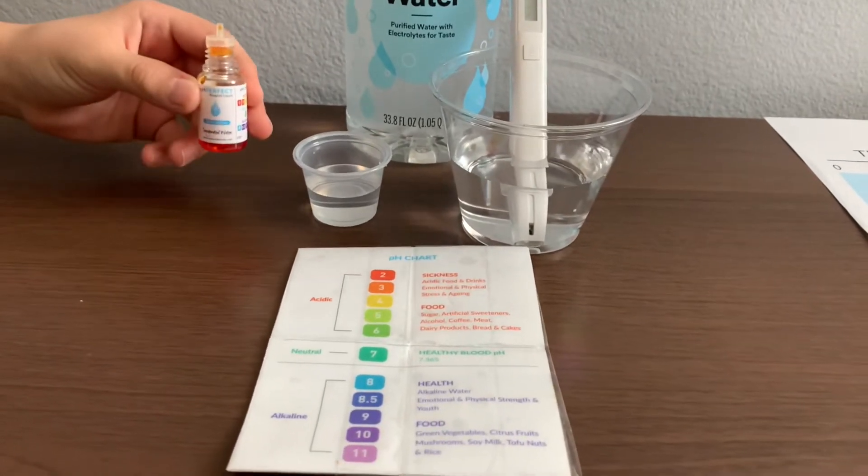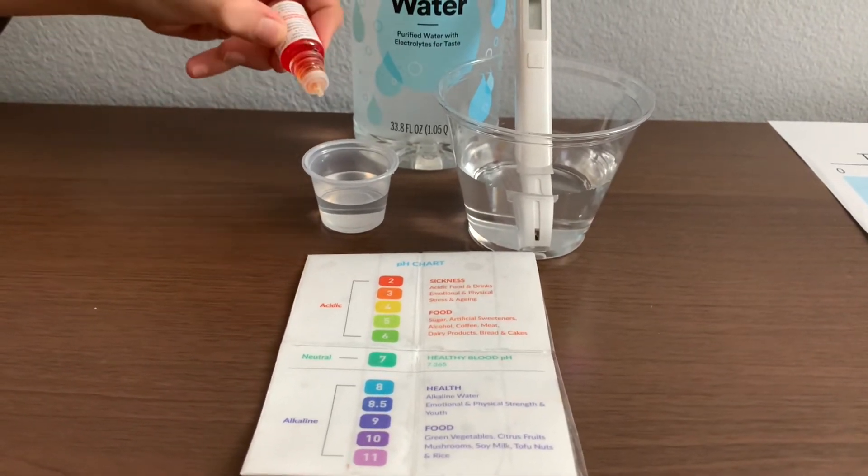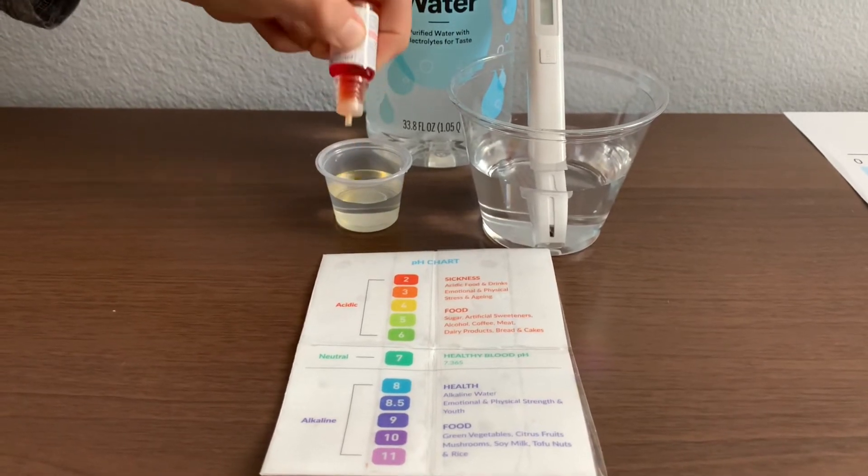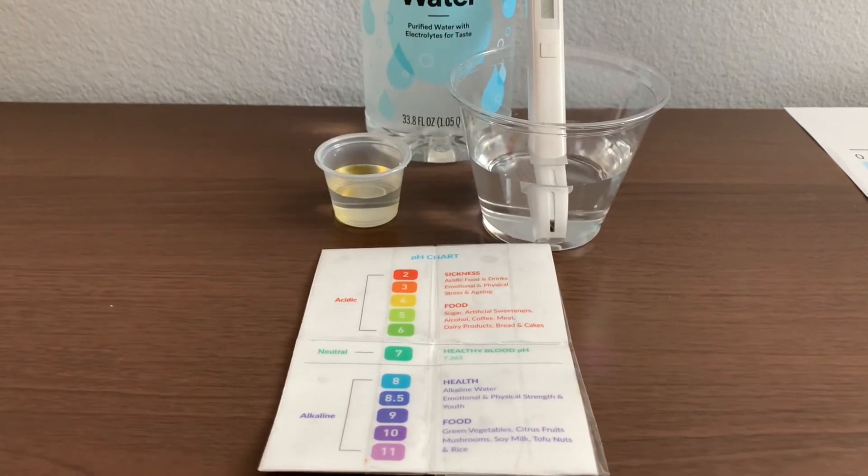Now let's test the pH level. Only do two drops. Let's stir it a little for a better result.